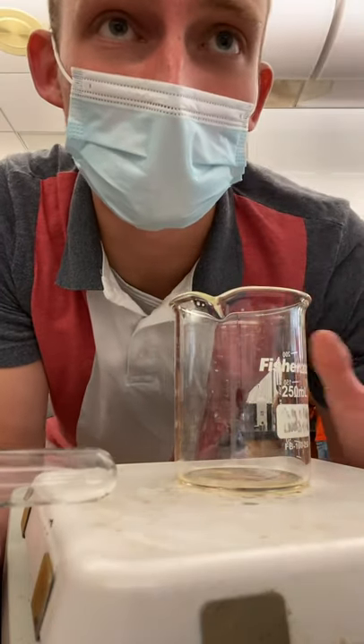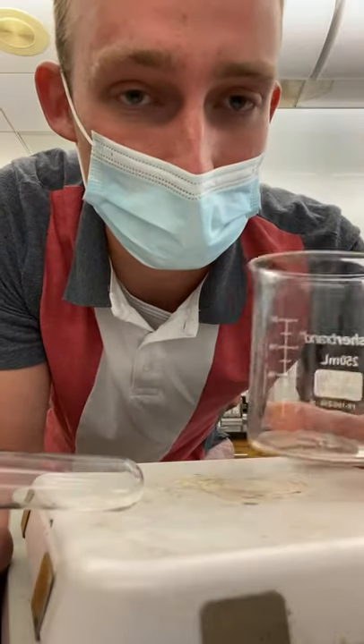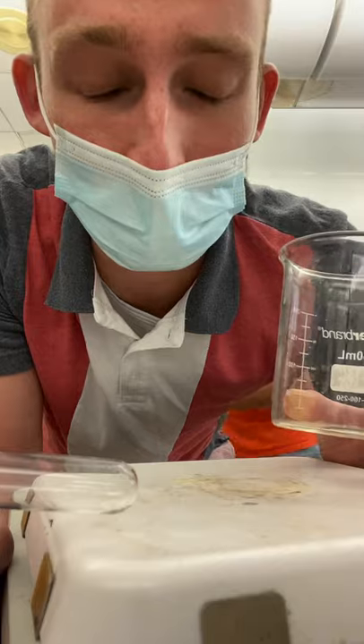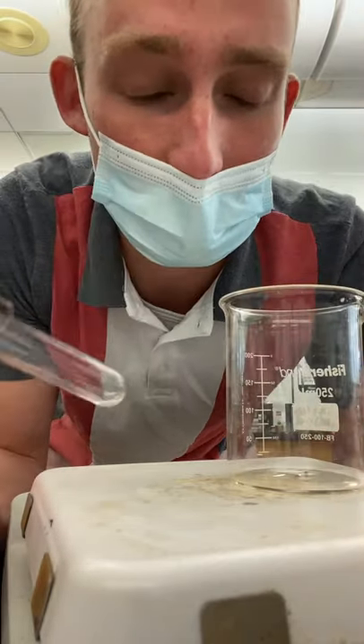In this video you're going to be heating a test tube using a beaker. The best way to do this is to get your 250 milliliter beaker and fill it halfway with water. For this demonstration, the test tube and the beaker are going to be dry.